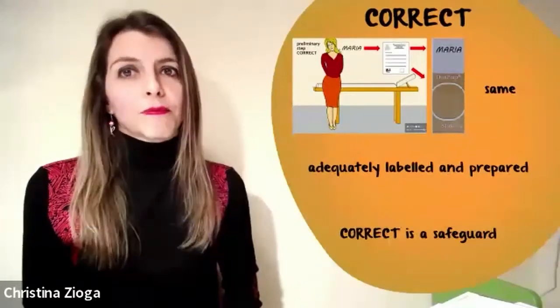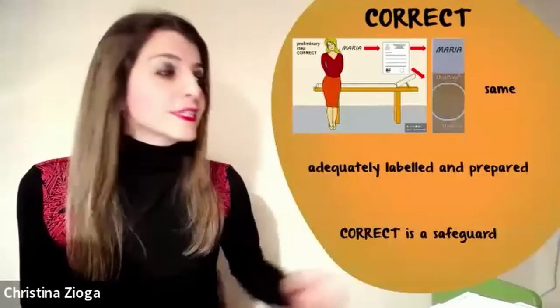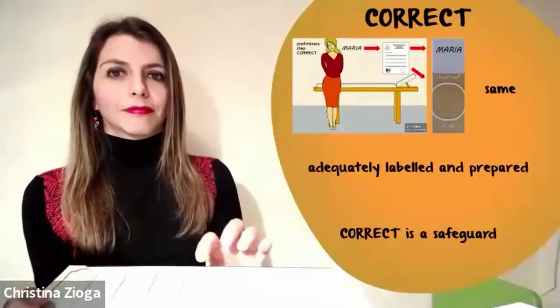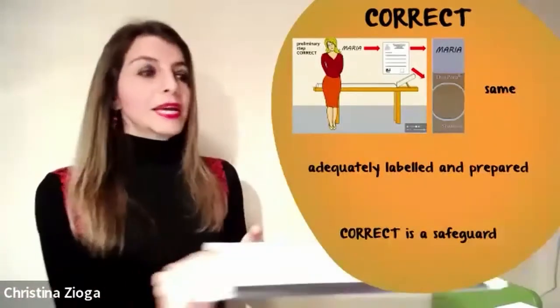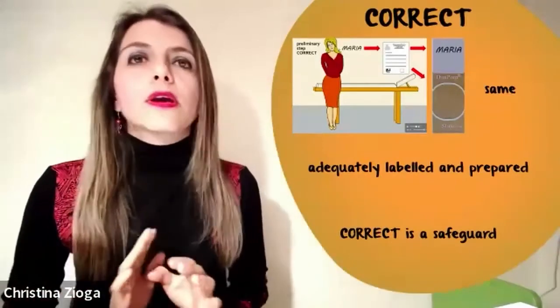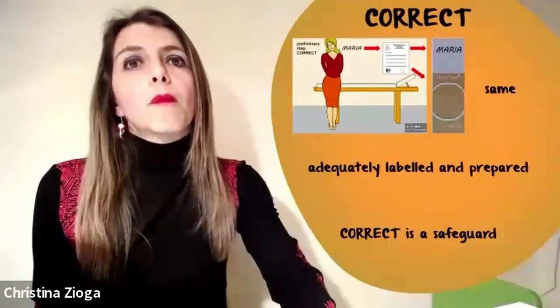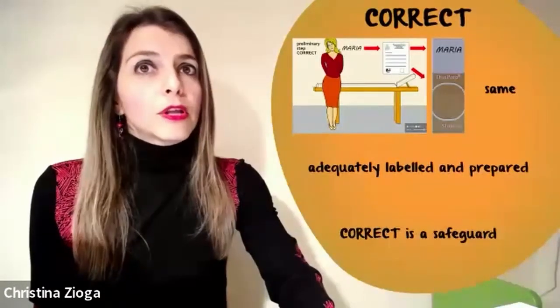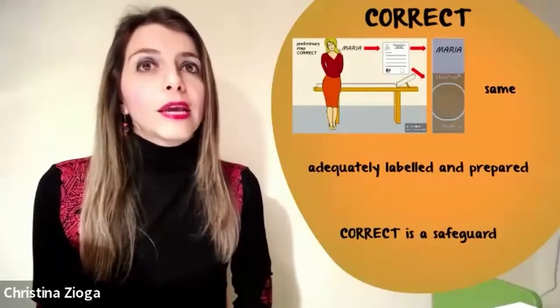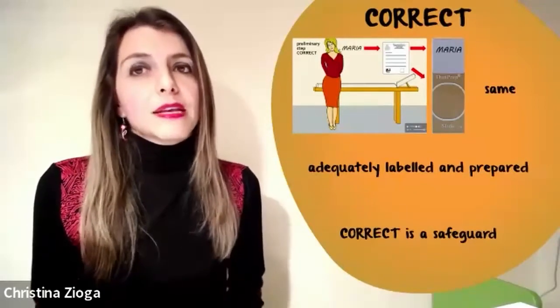I can reassure you that a pre-analytical error, like swapping the order of a slide or the request form, can happen no matter how careful, watchful, alert, attentive, or cautious we are about our job. In our laboratory, approximately twice per year and per colleague, the correct step saved us from making mistakes.